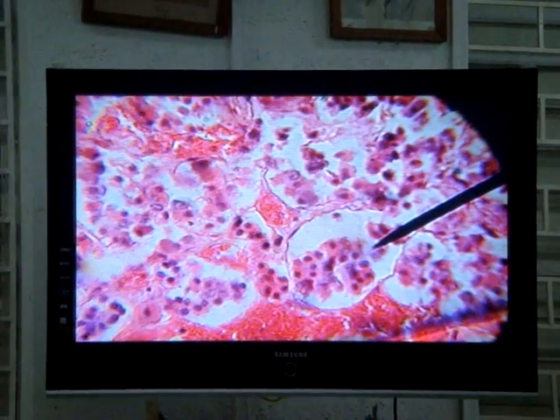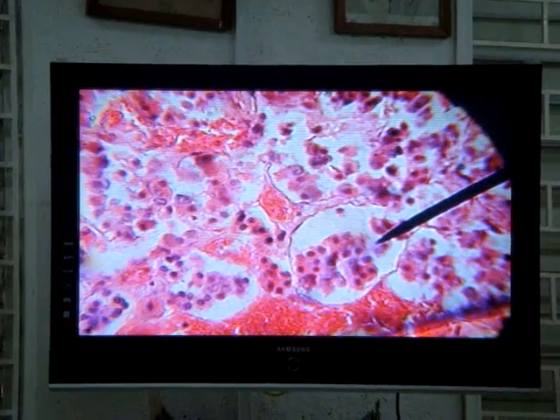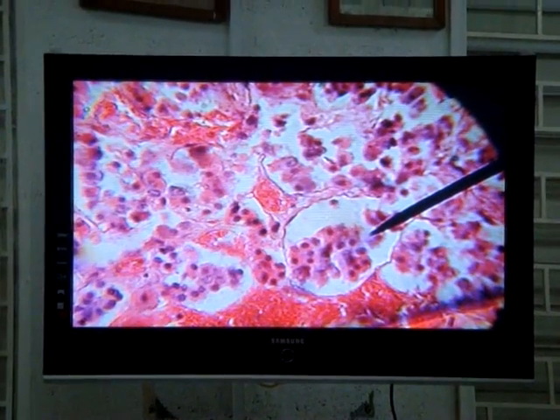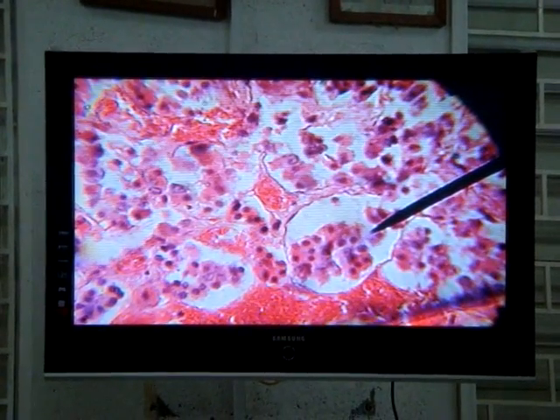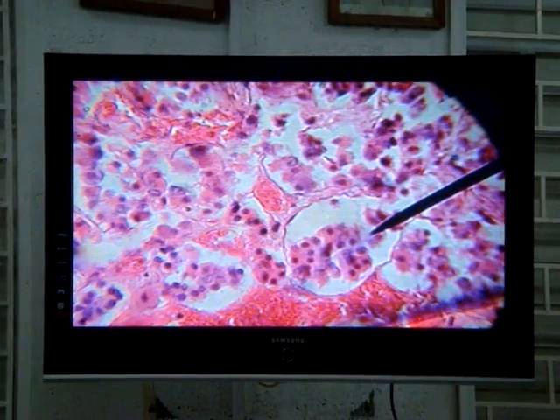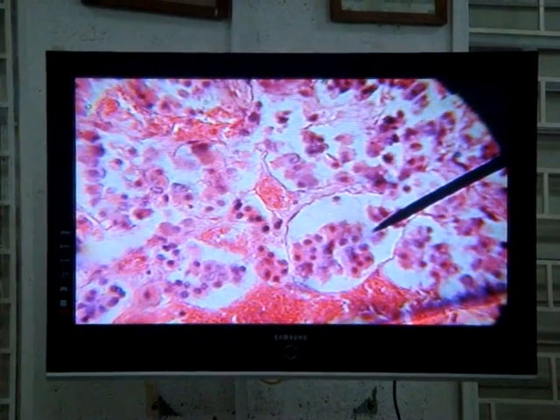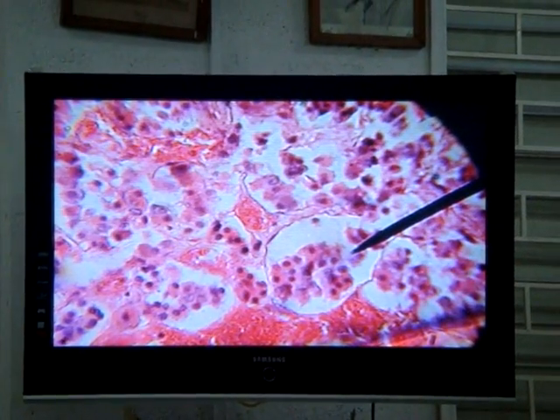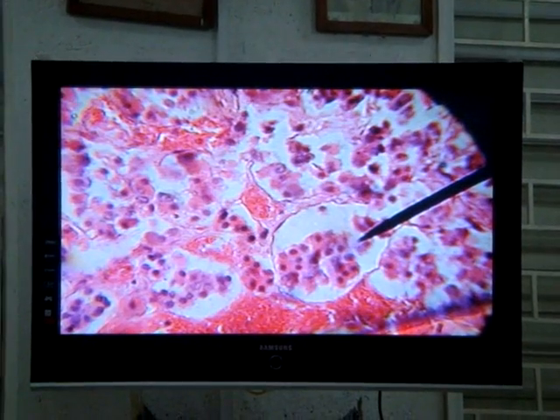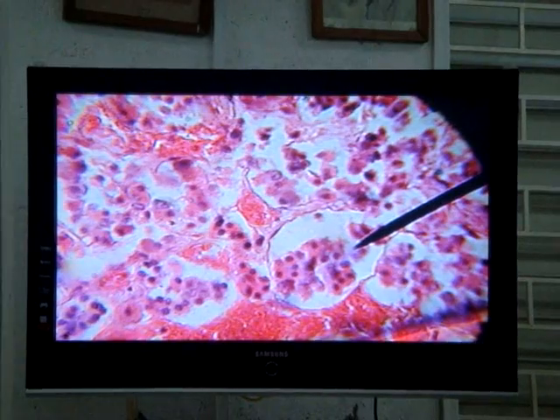And so these clusters are sometimes described as cords. What we have observed is that most of the endocrine organs have their functional parenchyma cells organized in the same way, cords. The only endocrine organ that's not organized like that is the thyroid. All the others are organized with the cords.